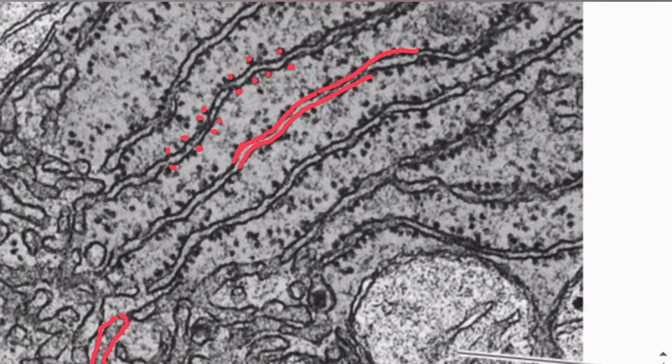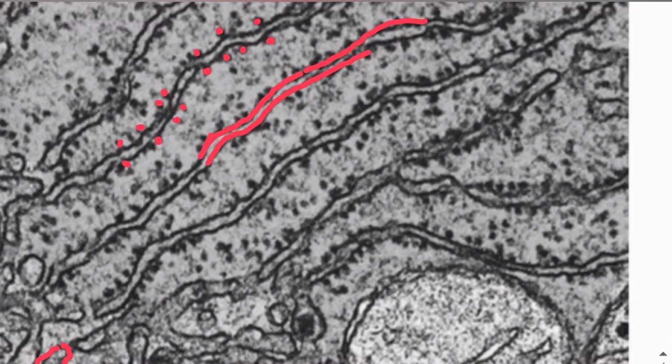You can see in the RER as well, the boundaries of the sacs are dark, but ribosomes appear separate. So ribosomes will always appear separate. You don't have to consider the dark boundary of the sac to identify that it is RER. To identify RER, you need to have a look at the small dots at the external surface of the sac.